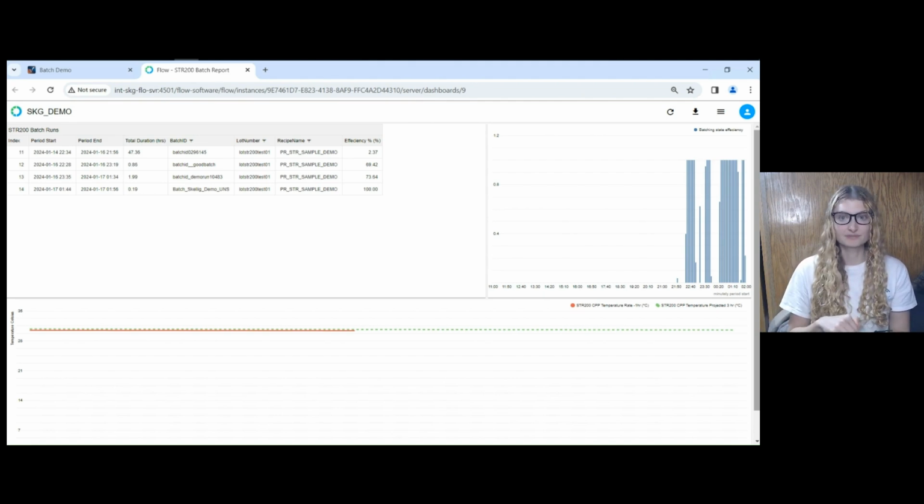At this plant, Flow is predicting our critical process parameters, and if an hour from now they're outside the high or low alarm limits, Flow is going to send a remote notification to a proper user group via text, Slack, or email. This way, if you're at your desk or not even at site, you have time to start investigating before something becomes a deviation, you need QA, or heaven forbid, risk losing a batch.